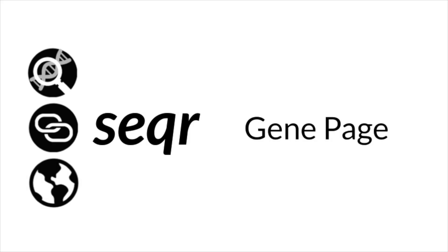Hi, I'm Gabrielle Lemire, a medical geneticist and genomic analyst at the Broad Institute of MIT and Harvard. This video will provide an overview of the information available for each gene in which a variant is returned from a Seqr search.